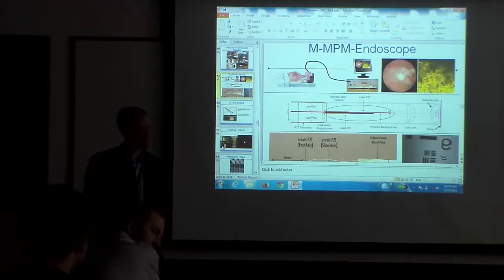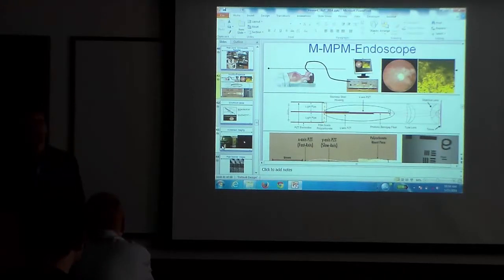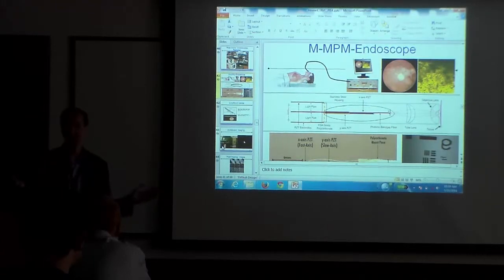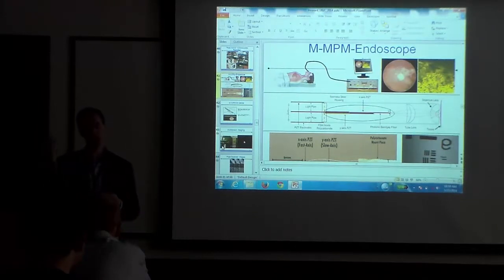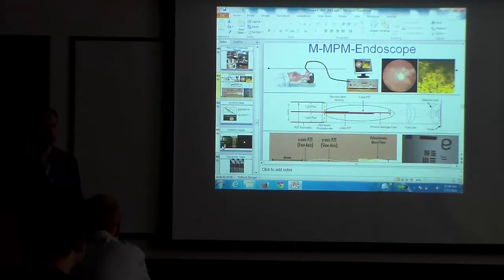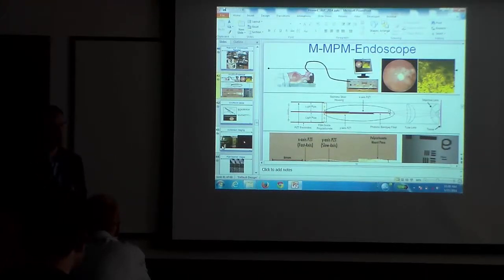So in your oxygen quenched probe, if you're exciting oxygen to its singlet state, are you getting any sort of PDT effect? Oh, yeah, singlet oxygen has lots of problems with that. Reactive oxygen species are very damaging to your cellular stuff. Additionally, they also fluoresce at 1250-ish nanometers. Luckily for us, 1250-ish nanometers is past the cutoff of our detectors, so we won't see that fluorescence.